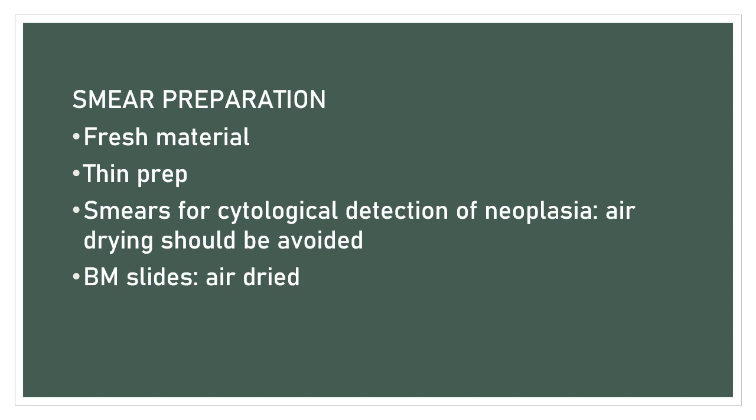For samples collected at the doctor's clinic, they should be sprayed right away with fixative, so they are fixed right away.